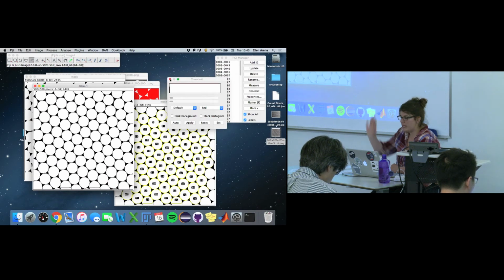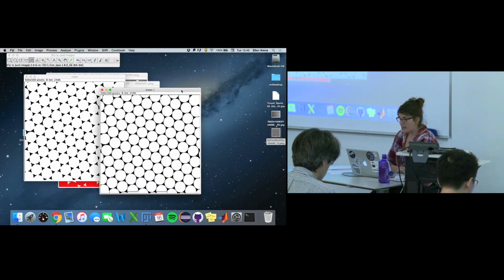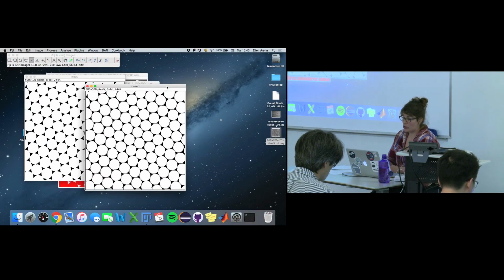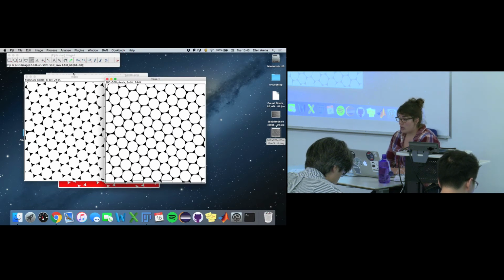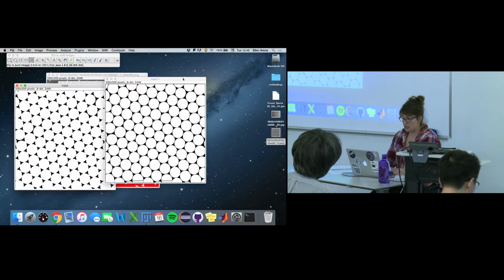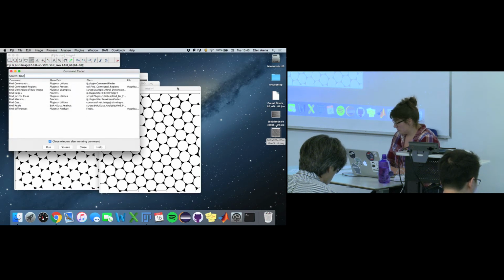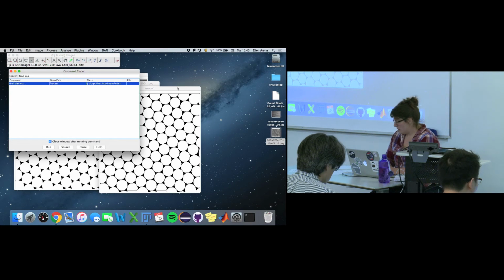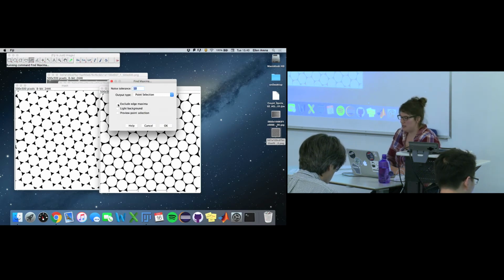So if you just close that ROI manager, you don't need to save those overlays, and just open that mask that you created that has the watershed. If you don't have that one, just watershed quickly the mask that you did before. And there's another tool you can use on this mask called Find Maxima to help you count these objects. So it's Find Maxima. We're just going to use the default here, but we're also going to exclude the edge maxima. Just like with the particle analyzer, we excluded on edges, we're going to click this here, exclude edge maxima.